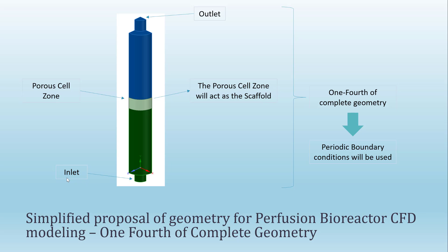You can see this in the presentation. You see here that I am only using one-fourth of the geometry. Then I also have a fluid inlet, a fluid outlet, and also the porous cell zone is used as the scaffold. But for using this geometry, only one-fourth, we need to use periodic boundary conditions in this face and in this face. Further in this video, I will explain how to set up these periodic boundary conditions.